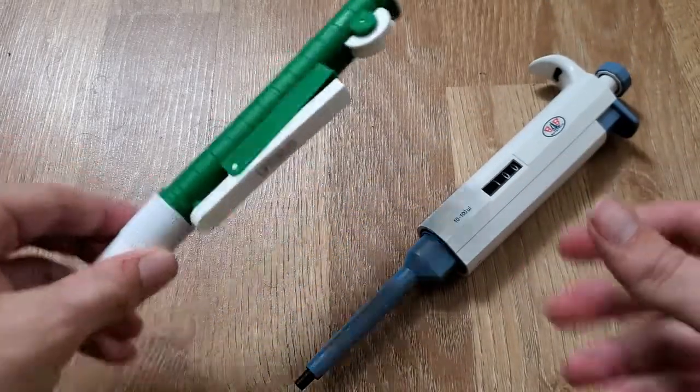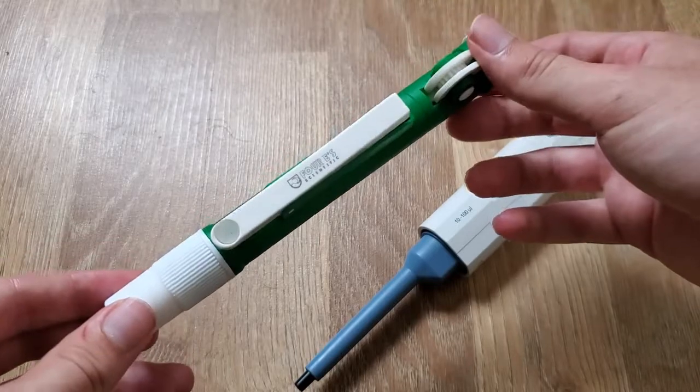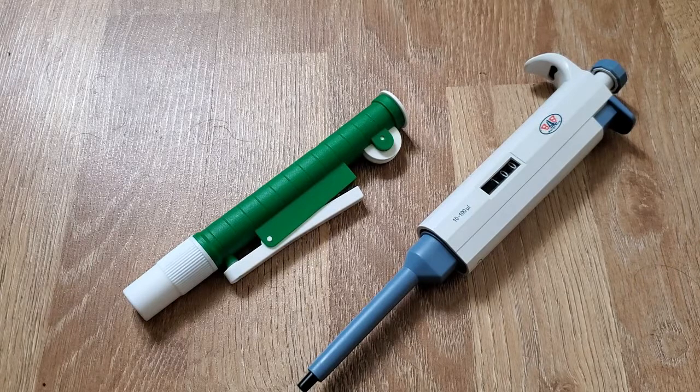The other type of pipette is the serological pipette. Most of the time in the lab these are actually electronic, but I have a mechanical one here. This is basically for volumes around 2 mils up to 25 mils typically — sort of in between when you would use beakers and volumetric flasks, and slightly larger than micro pipettes.